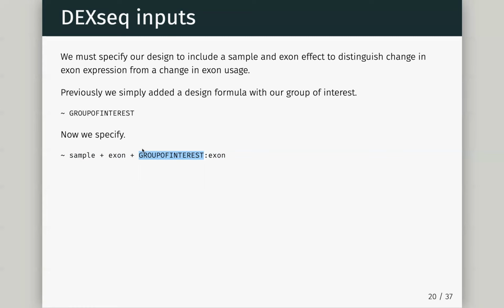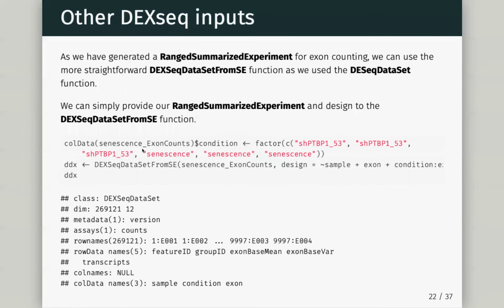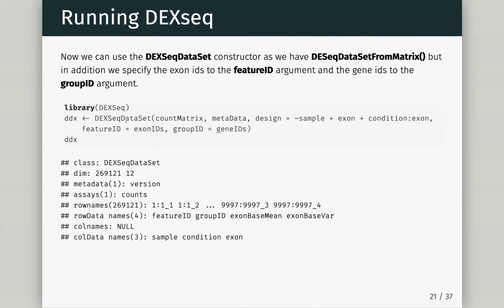So this is always the setup. I just wanted to show you what it looks like. So then, in order to actually run our DEXseq experiment, we can just use the DEXseq data set constructor.